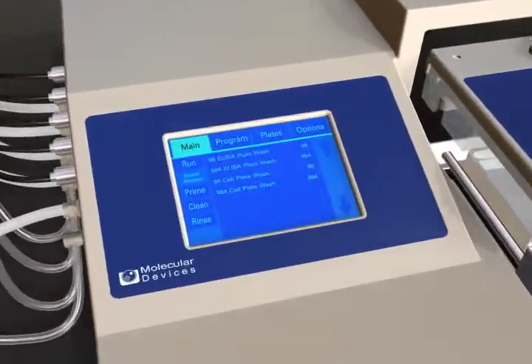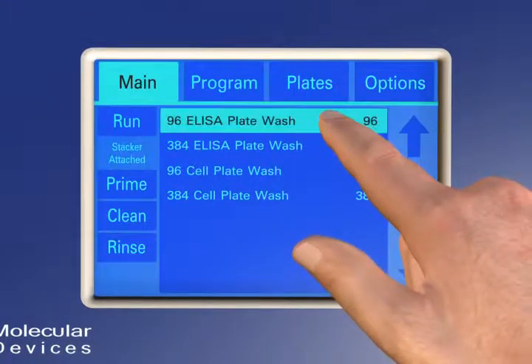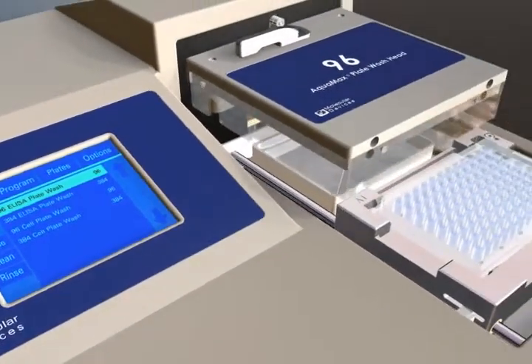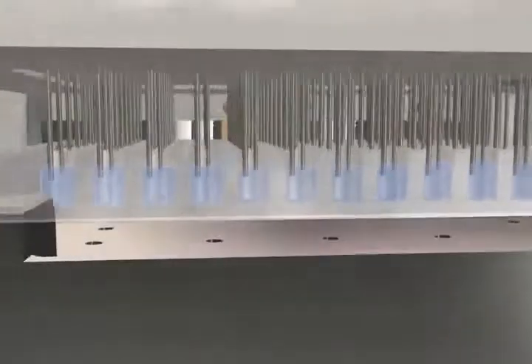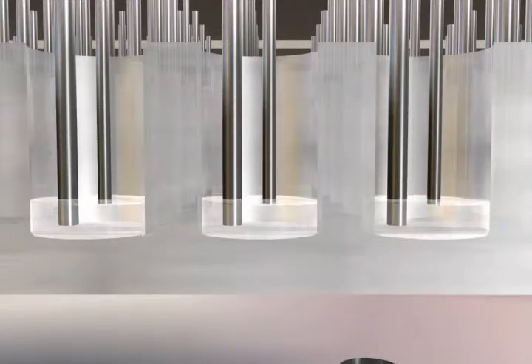Using the intuitive touchscreen user interface, wash programs can be easily set up and run for both 96 and 384 plate formats using the interchangeable heads. Since there is no need for plate indexing or quadrant pipetting, high assay precision and faster microplate processing can be achieved as aspiration and dispensing of all wells occurs simultaneously.